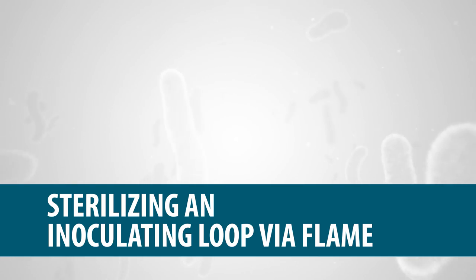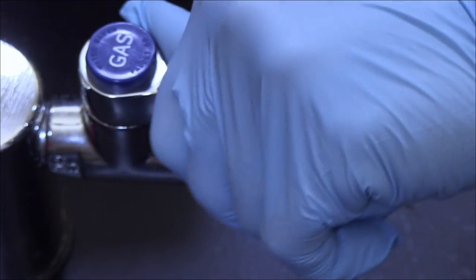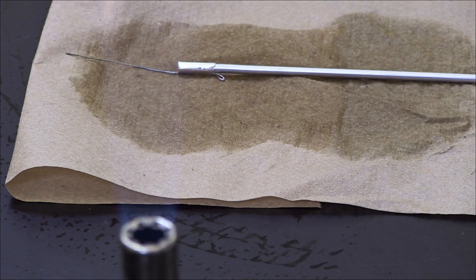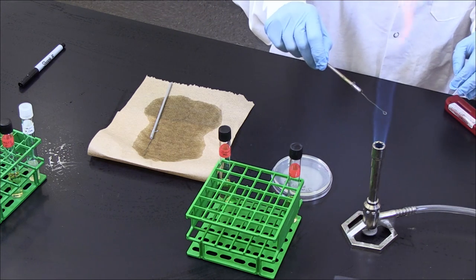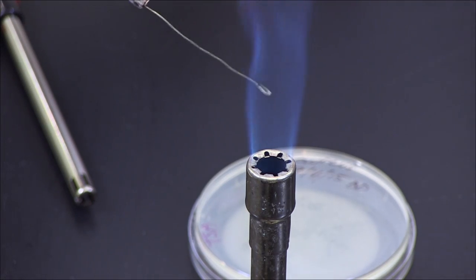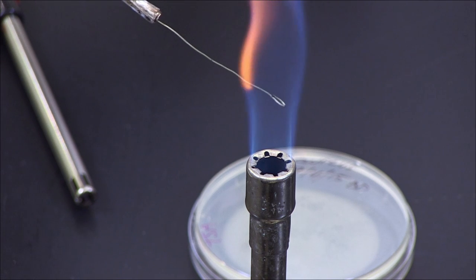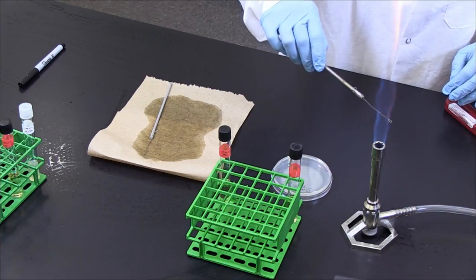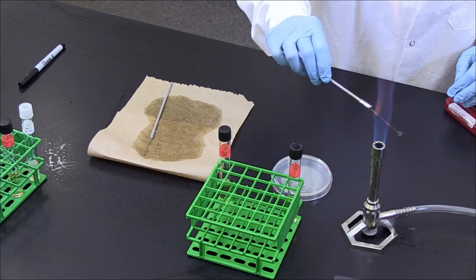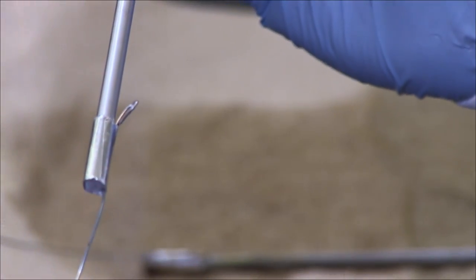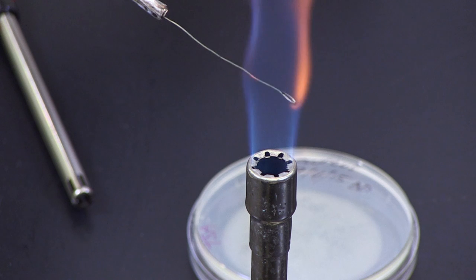Sterilizing an Inoculating Loop via Flame. Pass your inoculating tools through the hottest part of the flame, which looks like a blue cone from a Bunsen burner, to sterilize them. Once sterilized, the inoculating tools should not be touched or set down on any surface. Always work close to the flame, as it generates hot air that reduces airborne contaminants.